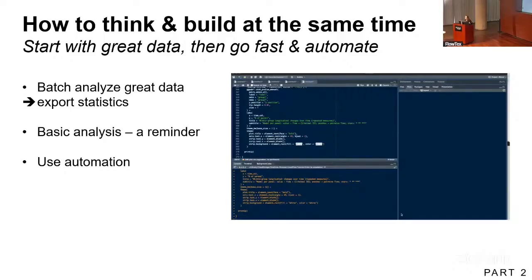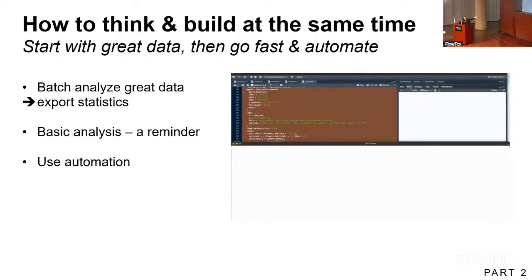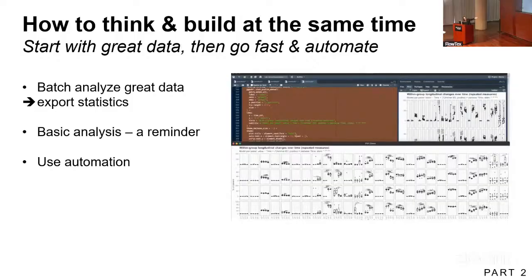This also introduces errors, and it is quite slow. However, if you work from a structured spreadsheet, you write a code once, and the first time could take you a while, could take you a day, it could take you 2 days. But every time longitudinally you add data to that spreadsheet, you run the same code over and over and over again. And 5 seconds later, you've analyzed every single cell population.